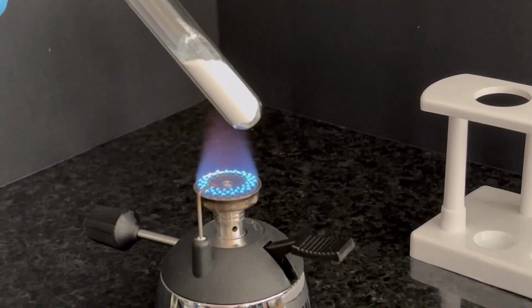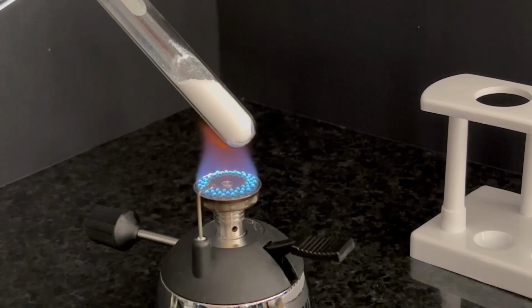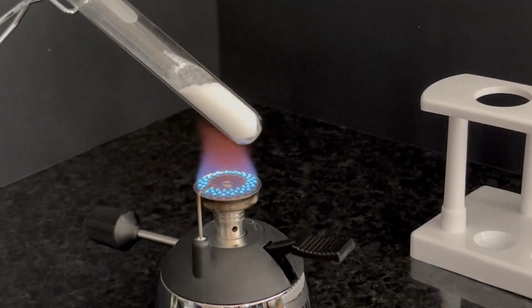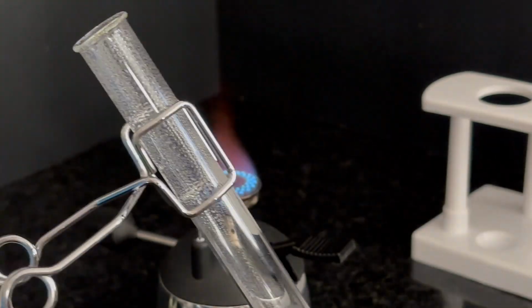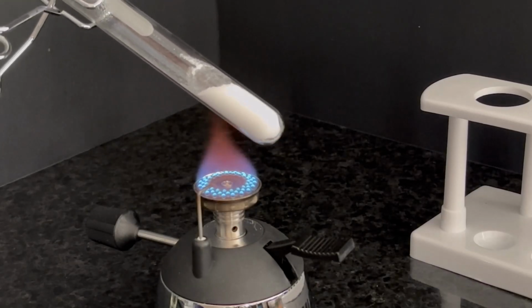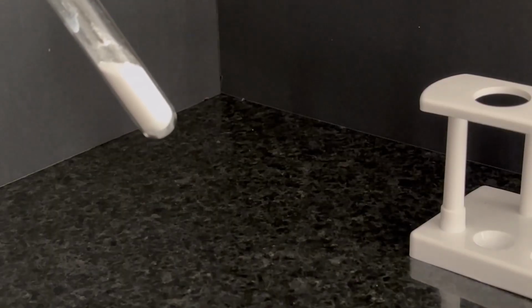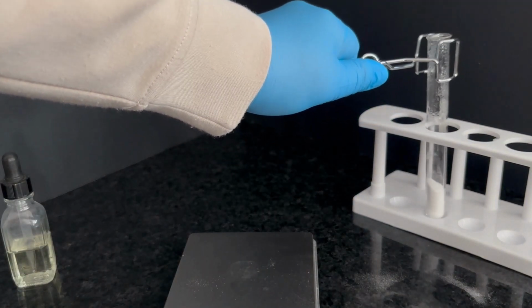Notice the tiny streaks in the powder as the gas tries to escape. You can also see the water droplets on the sides of the test tube.